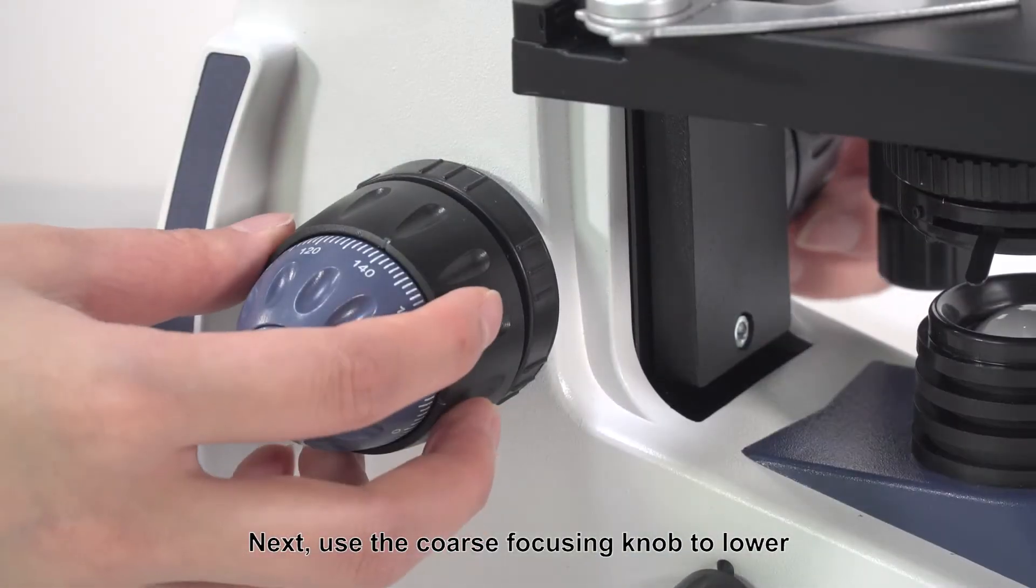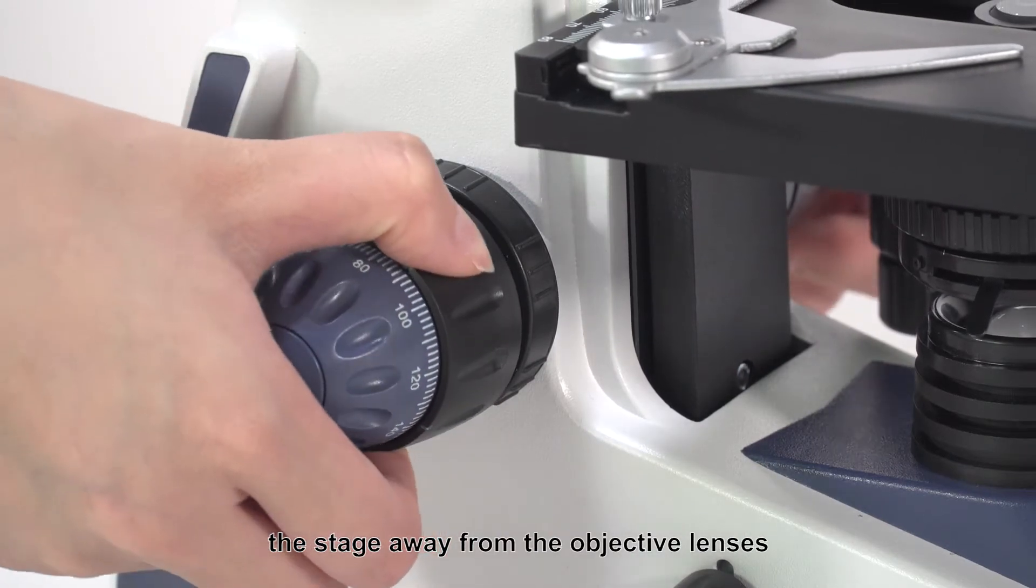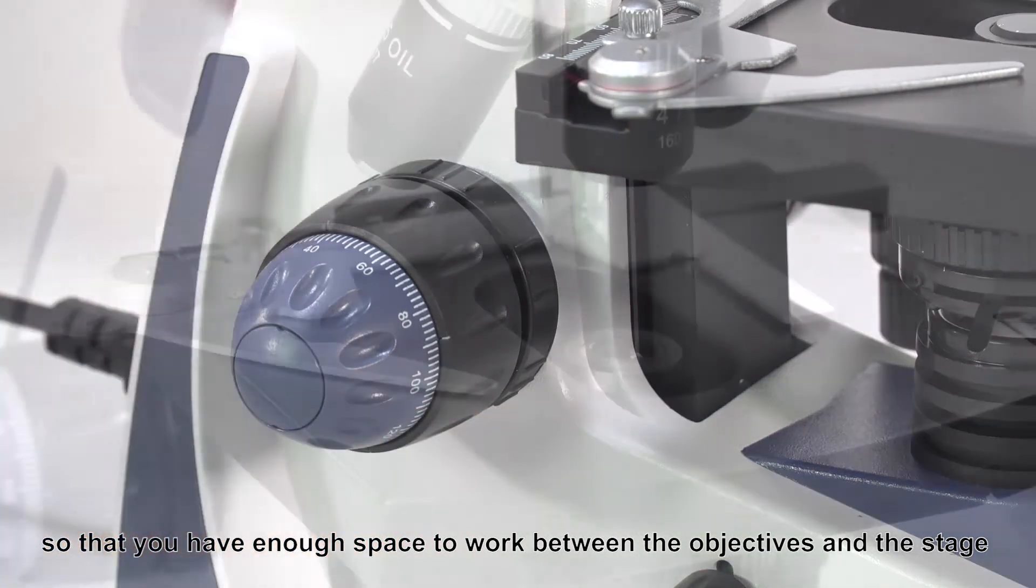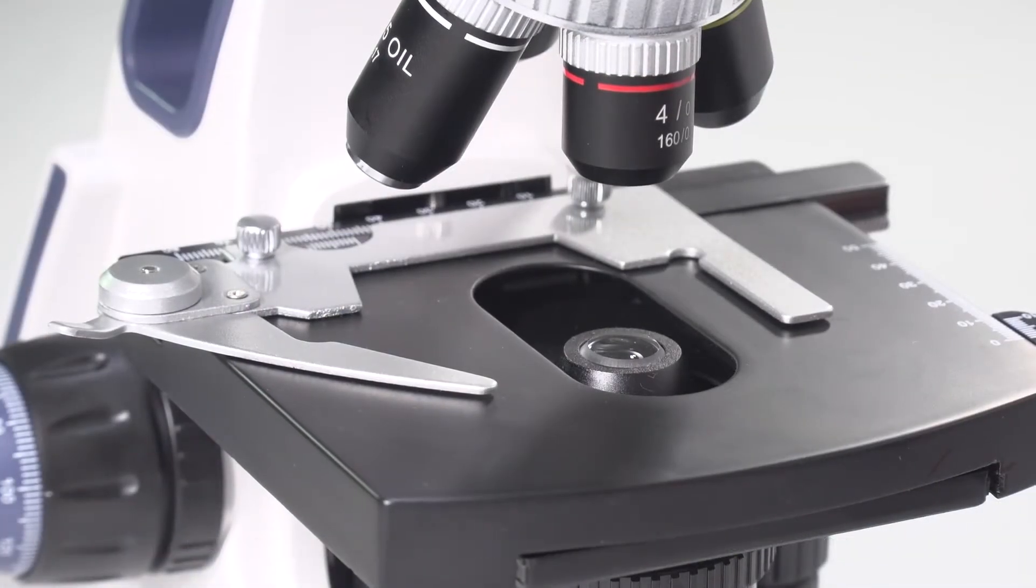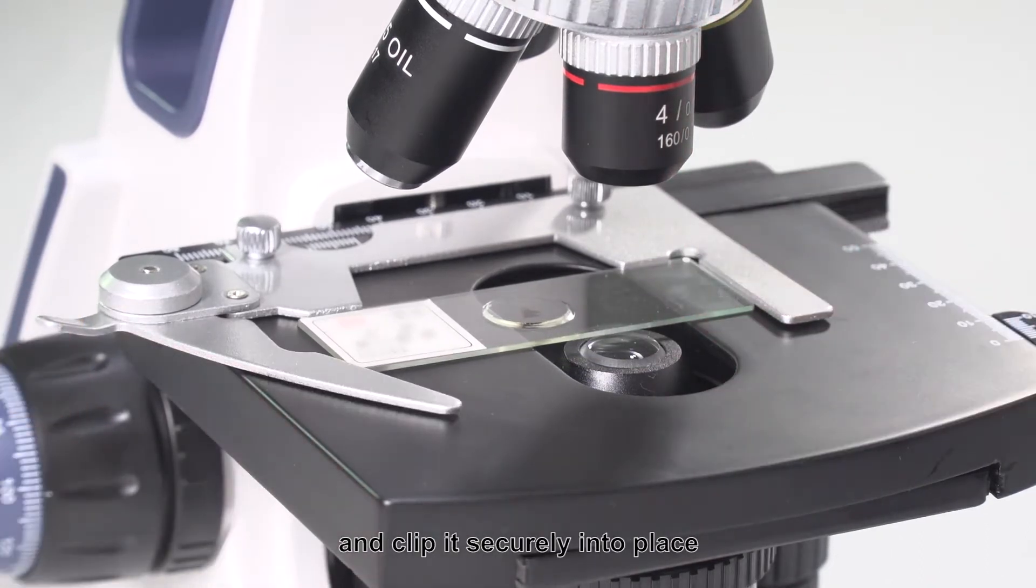Next, use the coarse focusing knob to lower the stage away from the objective lenses so that you have enough space to work between the objectives and the stage. Insert a slide into the slide holder on the stage and clip it securely into place.